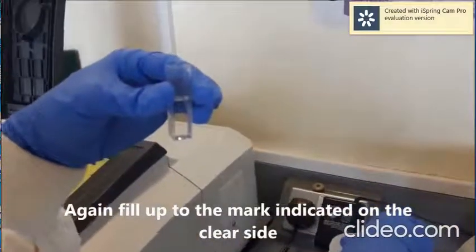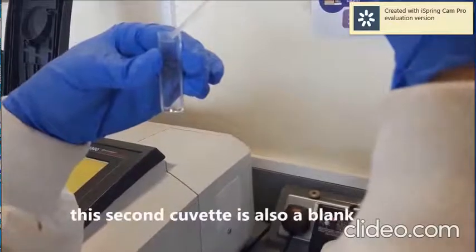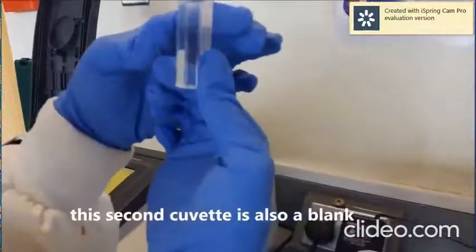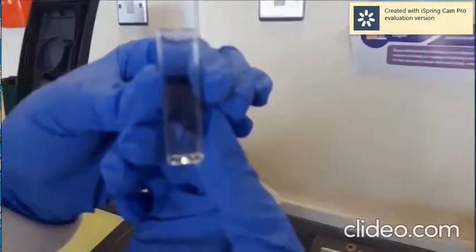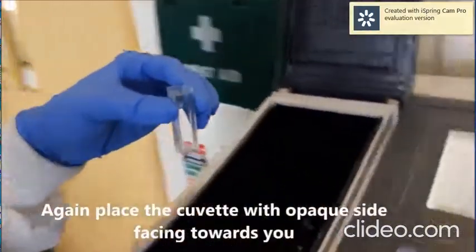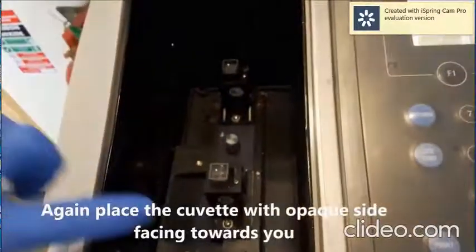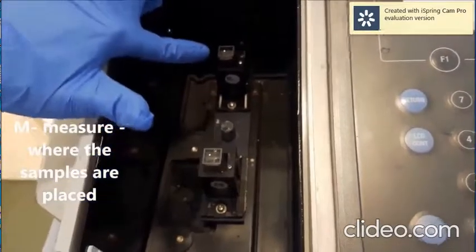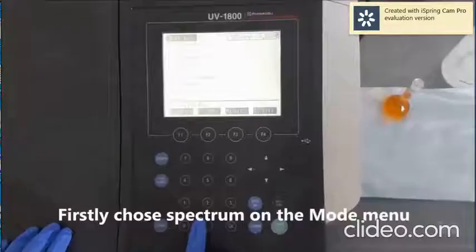Now once we have placed both the blanks, where R stands for the reference, and here also we have given the reference standard. To make the machine ready, we have to go for spectrum mode first, then set the desired wavelength and the required range, meaning up to what we have to fix.